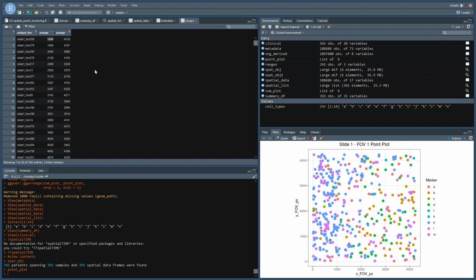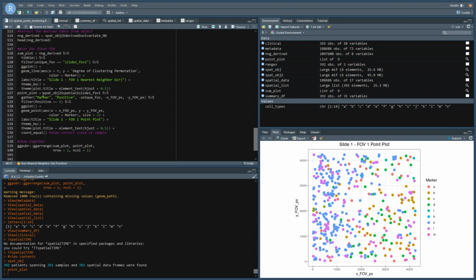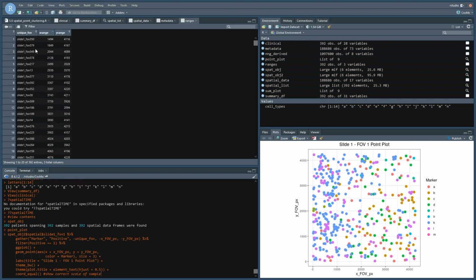So we need to stay well within this. So this is going to be the entire size of our field of view, but we need to remember radius, and then we need to stay well within this. So I picked a radius of 200, which might be a little small, so we could actually go ahead and plot this one here and see how this looks. Field. So let's pull this out, and then go back to our range so we can see the shape of this guy here.